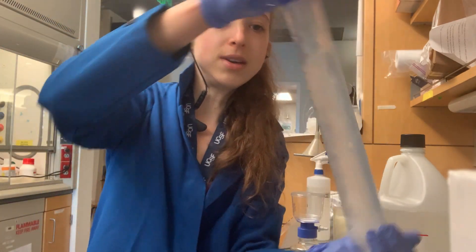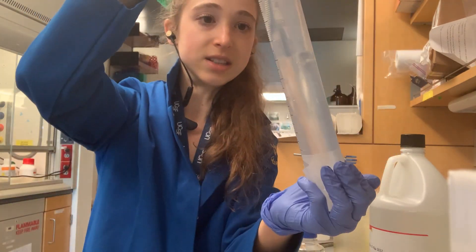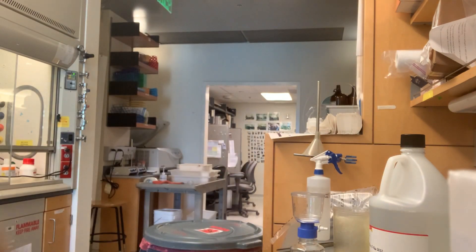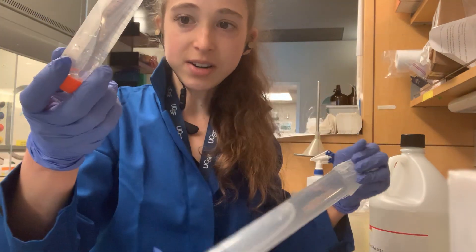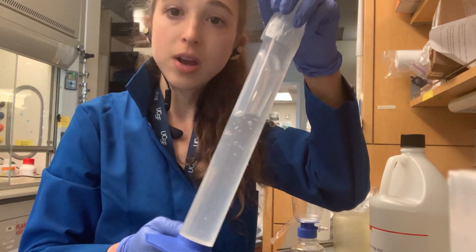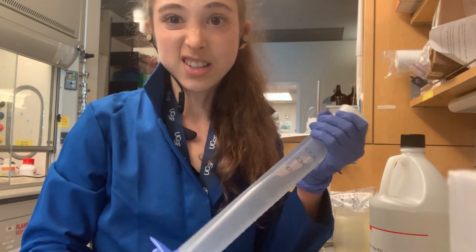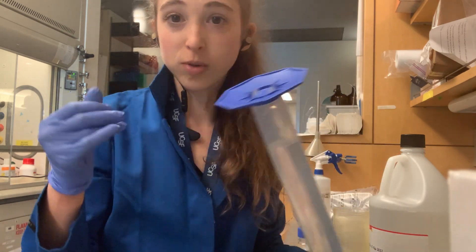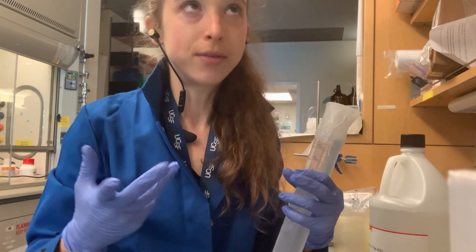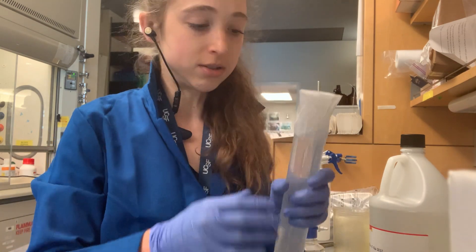Mix thoroughly, and you can already see it's flowing much better than the 100% glycerol, so it'll be much easier to pipette too. You can also do 50% glycerol, but keep in mind that if you want a higher concentration in your final working concentration you'll have to add more of it. If you wanted a buffer instead of water that could be an issue, but you could also make your glycerol stock in a buffer.